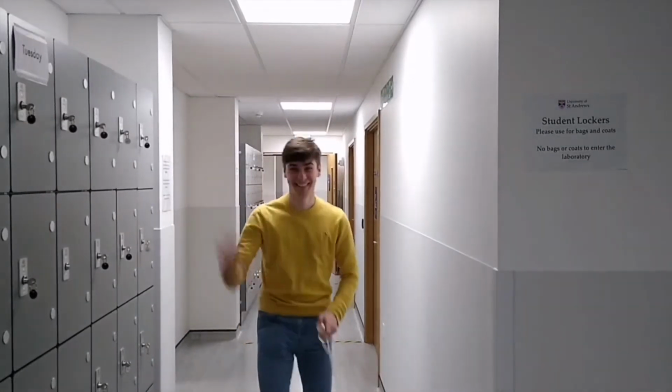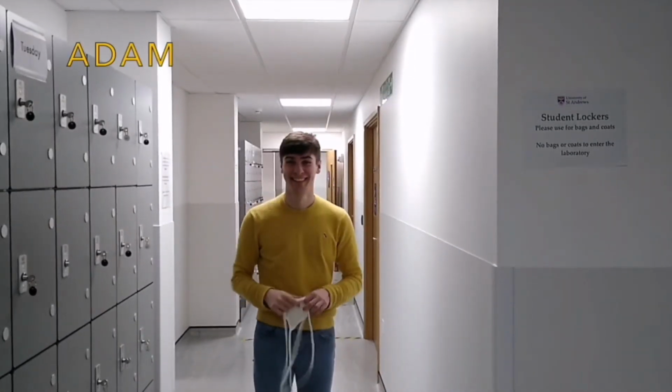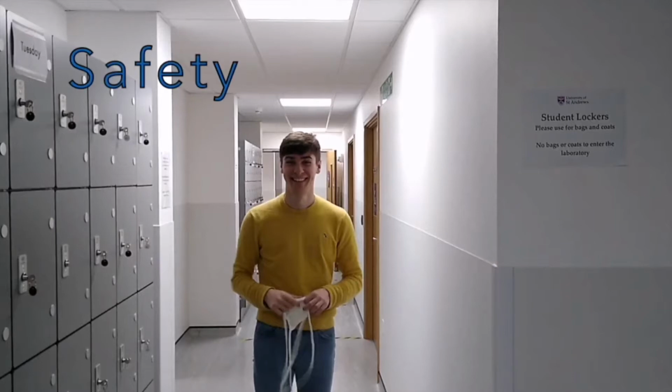Hello! Meet Adam. He's a biology student, and he's going to take you through collecting soil and checking it for all kinds of things. But first things first, safety. Adam needs a mask.